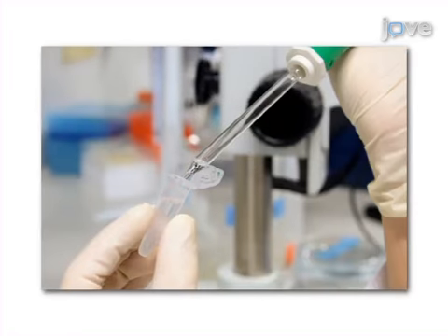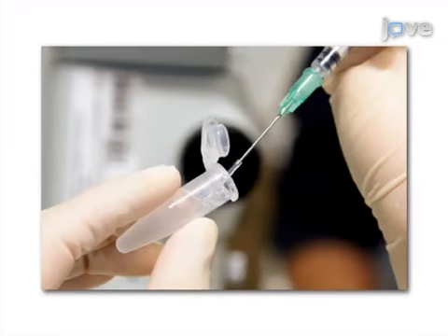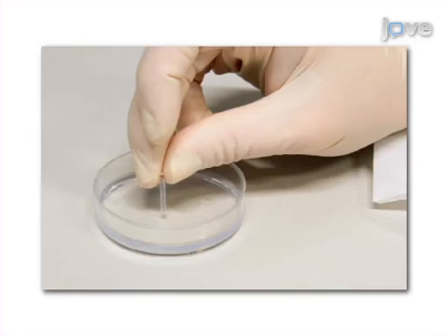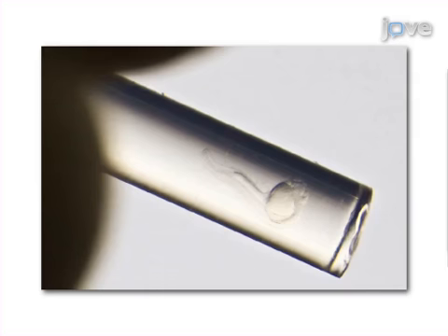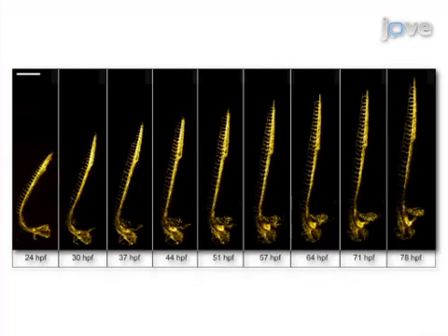The embryo is transferred first to melted agarose and then to the coated FEP tube. Finally, the bottom of the tube is closed with an agarose plug and the orientation of the mounted embryo is carefully checked. Ultimately, results can be obtained that show the unperturbed development of zebrafish embryos over several days with high spatial and temporal resolution through in vivo light sheet microscopy.